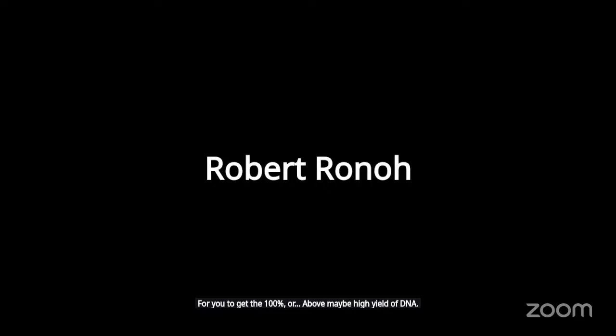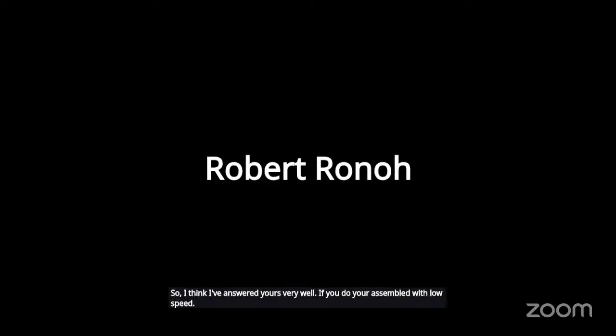So I think I've answered yours very well. If you centrifuge your sample at low speed, you will not achieve the target DNA yield you require. And if you use the correct speed for spinning, definitely you will achieve a good yield of DNA.